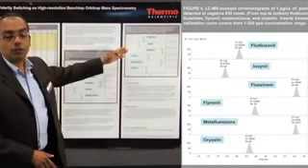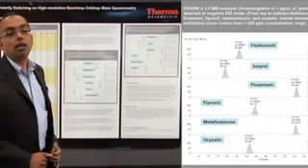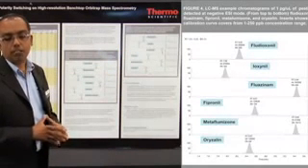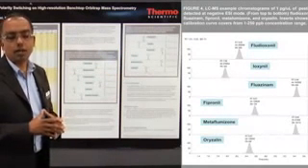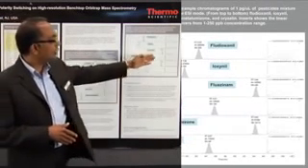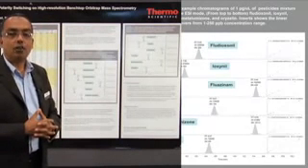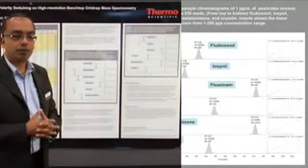Similarly, this figure here shows a selection of pesticides in negative electrospray mode. Again, the limits of detection is at 1 ppb, and the dynamic range is between 1 to 250 ppb. And on the right hand side here, we have the linearities for each of these compounds as well.